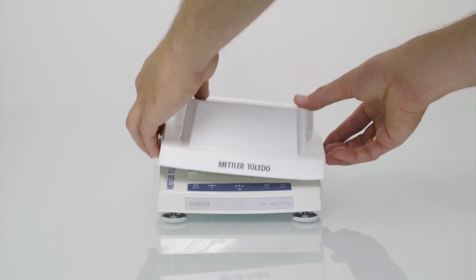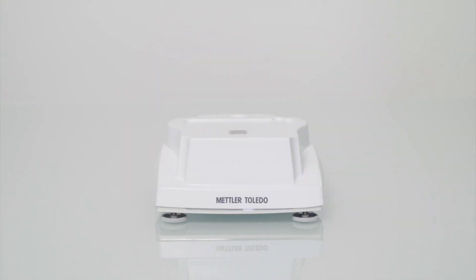They are also easily transported and stored thanks to specific covers. Simply stack and pack up to five balances for quick easy storage effectively protected against dust and dirt.